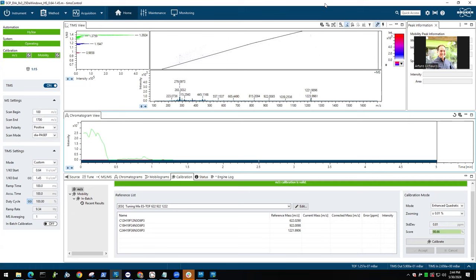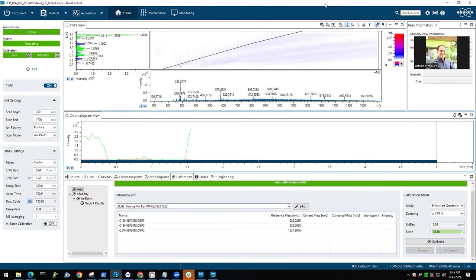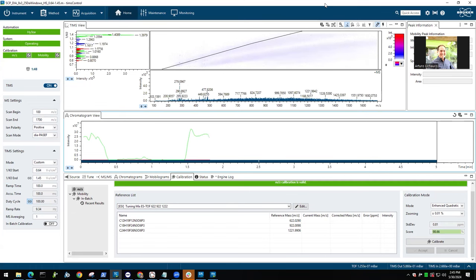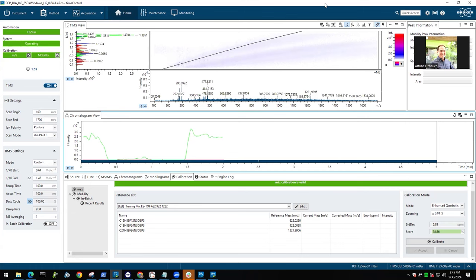And since we do trapped ion mobility, how that works is we have a gas stream from the back pushing our molecules into the TIMS cartridge, and we have an electric field to trap them at a given position in the gas space. So the bulkier your molecules are, the further they are pushed inside, because their projection in a three-dimensional space is much larger than when you have a tiny molecule. So you basically separate them by m/z, or by mass, but also by size. The heavier your molecule, the bulkier it probably is, so it will be further inside the TIMS cartridge. And so you trap them in the field, and then you slowly reduce your electric field to elute molecules one by one. And then those get analyzed.